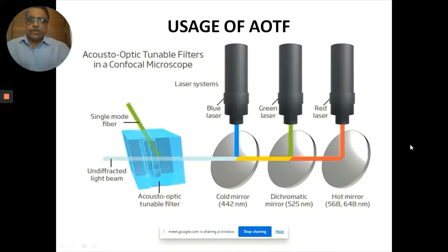They are not cheaper. They have to really put a lot of money on this, whereas in a normal glass filter, it's just a colored glass absorbing type of filter. Those are all very cheap. Here is a special class. They work for the selection of multiple wavelengths. One filter will work for multiple wavelengths.